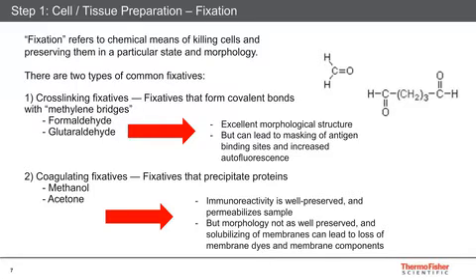Also, you could instead use a solvent-based method like methanol fixation. This permeabilizes the cells by delipidizing and opens up the cells and the antigen binding sites. Some antibodies need a solvent-based fixation, especially if it's a nuclear antigen. But be aware that it does not preserve the morphology as well as doing a cross-linking, like with aldehydes. You can also lose some membrane-bound components and proteins, or if you labeled the live cells with a dye that was a membrane dye, like DiIC18, it can be lost with acetone or methanol fixation.